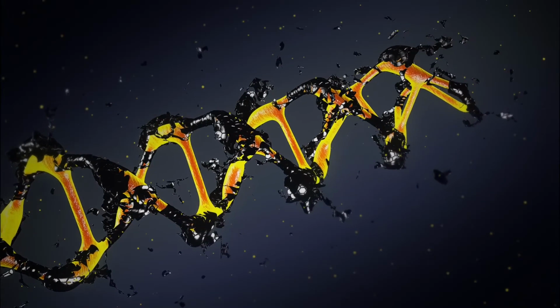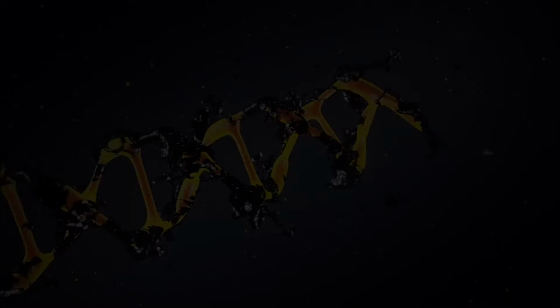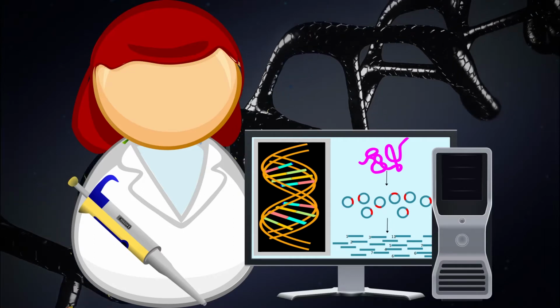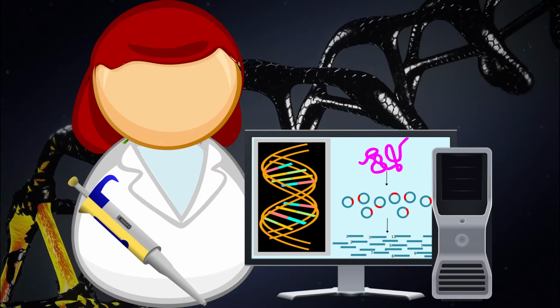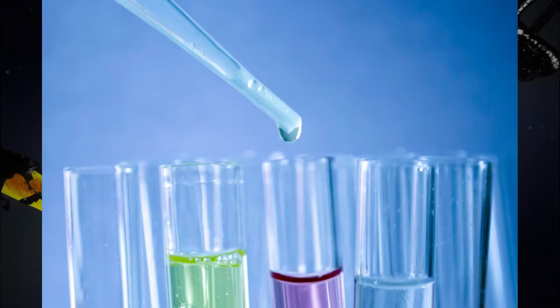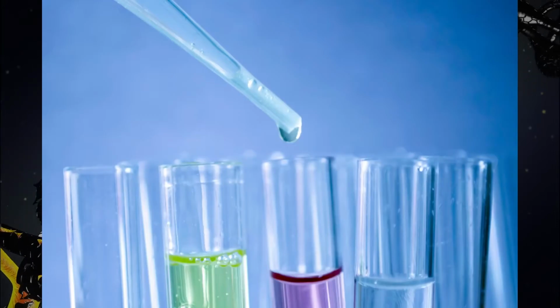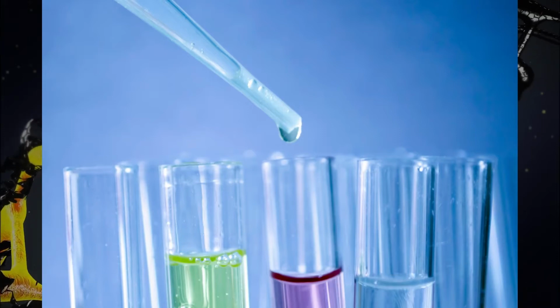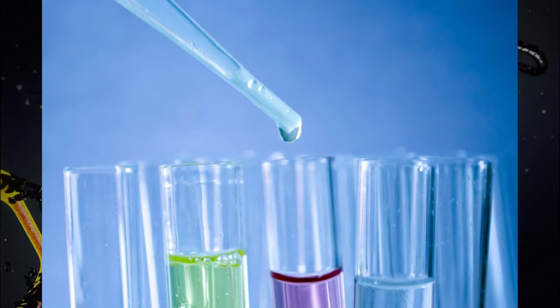The easier way to do it, and especially for some of the methods we'll talk about for PCR, is this probe. The probe signal becomes stronger the more the DNA is replicated. Therefore, adding the appropriate probe allows you to give a better, stronger, and more consistent result. Different options available include radioactive compounds, colored compounds, fluorescent compounds, and chemiluminescent compounds. The choice of which one you use depends on the system and the nature of what you're trying to investigate.